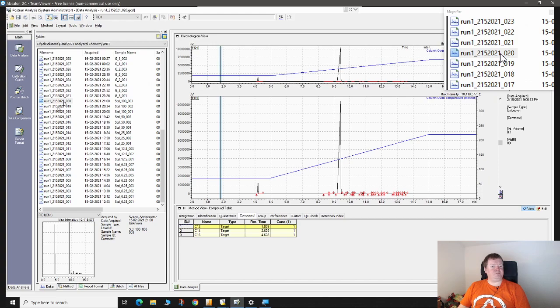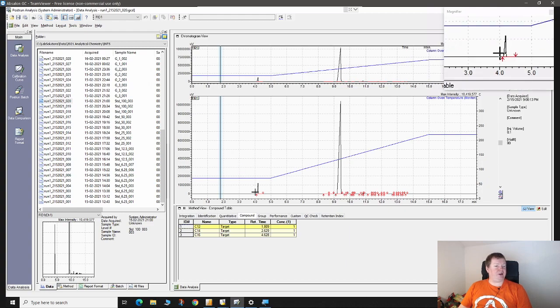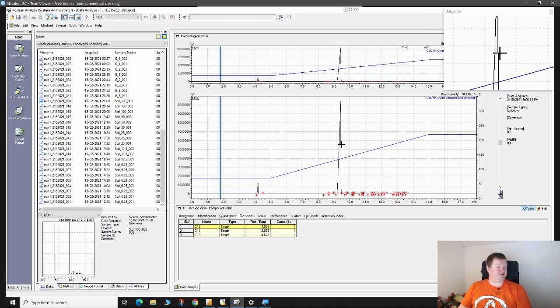Here we go. Now, if you look at the chromatogram you're getting here, right away we can see at least two quite obvious peaks. If I recall right, the first one will be the limonene, and the second one will be your internal standard. And actually, I don't know if you can see it, but we have an even bigger peak.